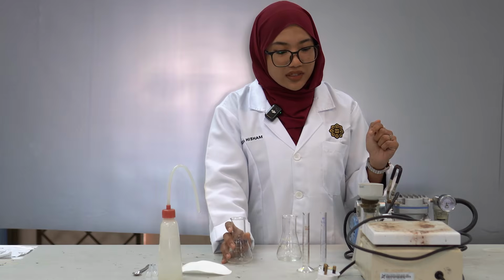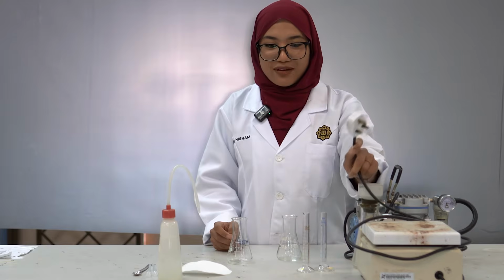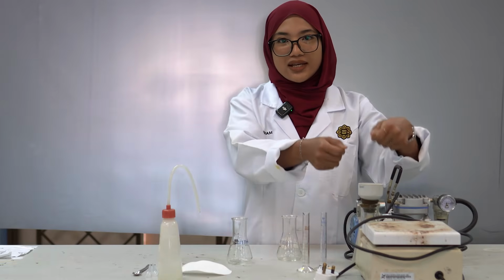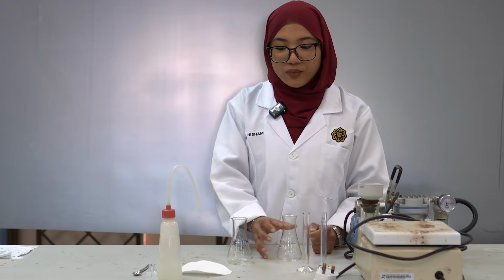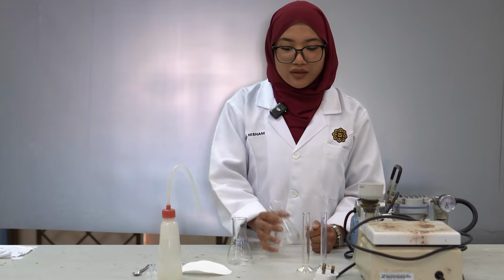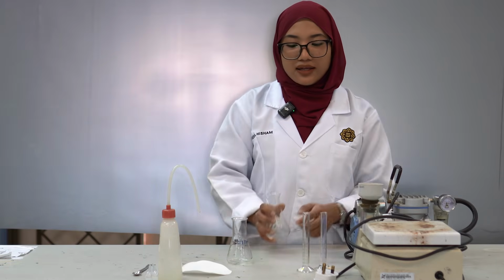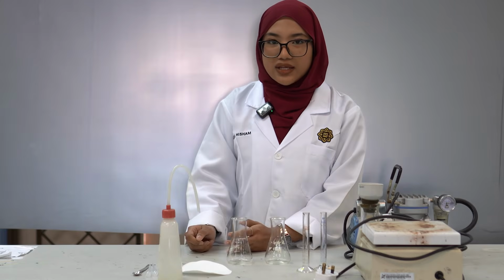Before that, we have to plug in the switch and make sure it is on. And after that we take out the crystal that has formed and put it aside to let it dry a bit. And after that we put another filter paper, we cut it also and put it here. And we put the mixture solvent that contains methanol and water here. And after that we wait for some time and we take it out and put it aside.